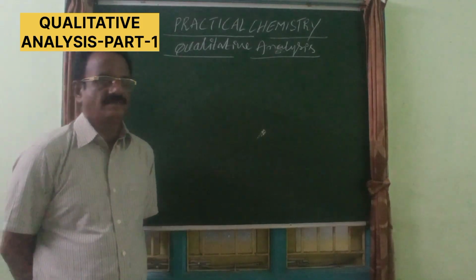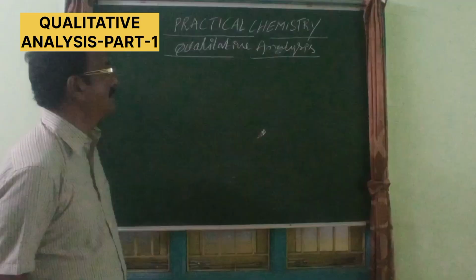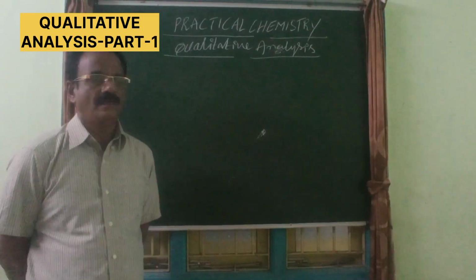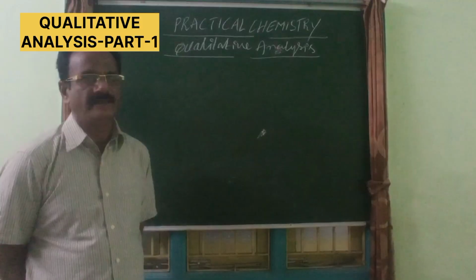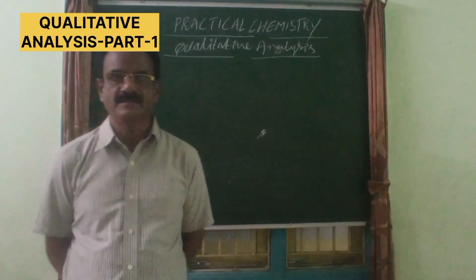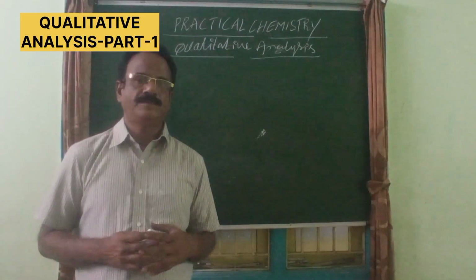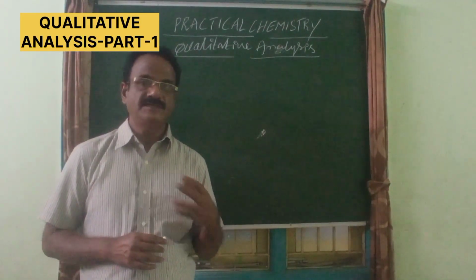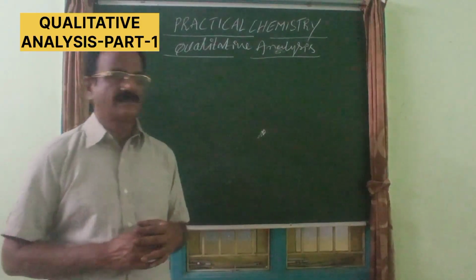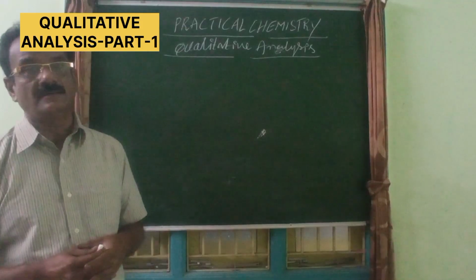Welcome to chemistry class. Today in this class we are going to discuss practical chemistry. Since this will take much more time, I have decided to make it as discrete parts. I will keep each part in the channel. So let us see qualitative analysis.